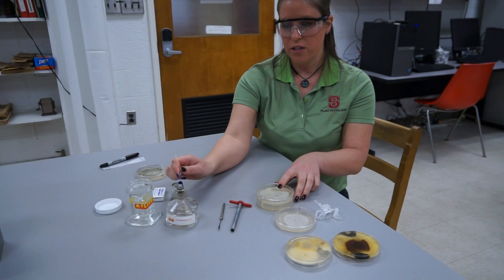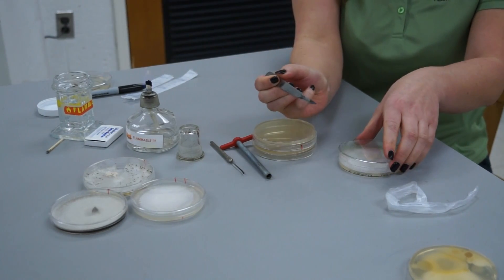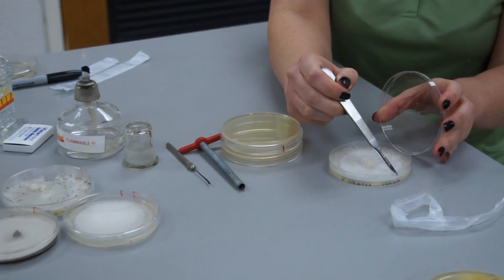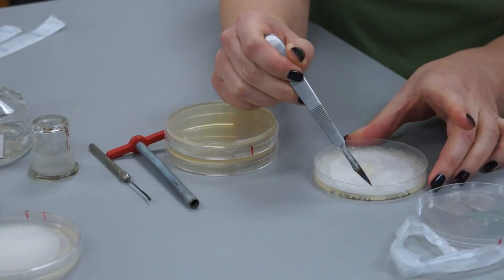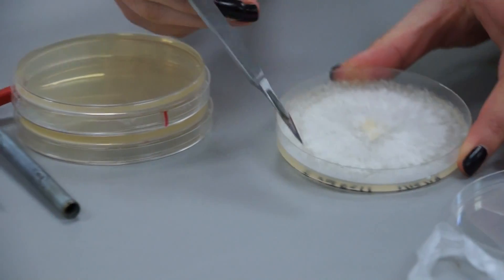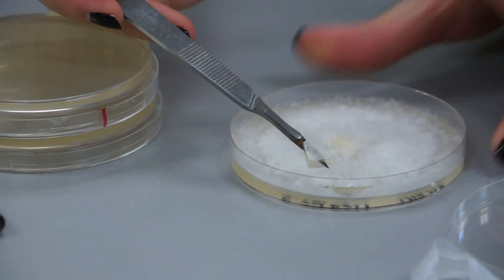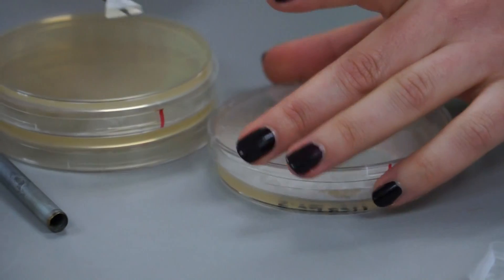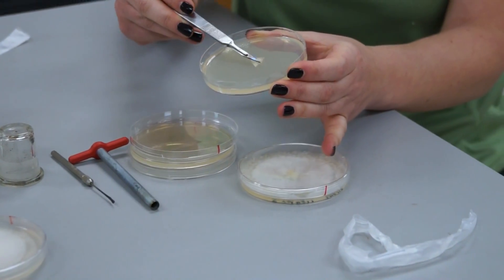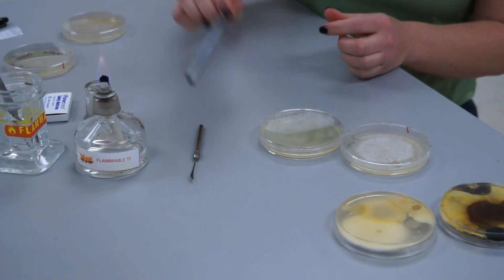We're using flame sterilization. After you flame your tools, you'll cut into a piece of the agar that you're not going to use so that you can cool your tools. As mentioned, you cut from the edge of the culture, and then you can transfer the culture mycelial side down onto the PDA. You can also do this with a cork borer.